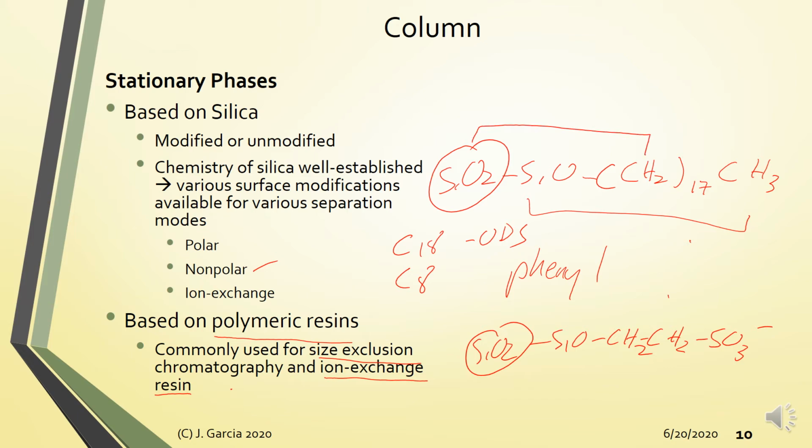Okay, now a word of caution when using derivatized silica, yung mga for non-polar. The problem with this one is yung usable pH nila, no? So the usable pH for bonded silica is around sa acidic range, mga around 3 to 8, no? pH 3 to 8. Higher than pH 8, you will be cleaving this bond. Alright? So if you cleave this bond, you will revert back to your silanol group, no? Which is something that you don't want whenever you're using a non-polar stationary phase, no?